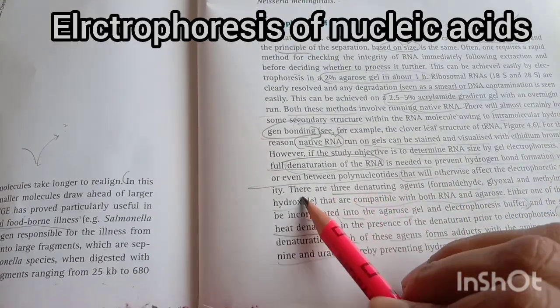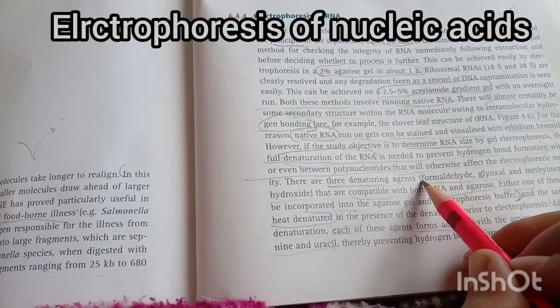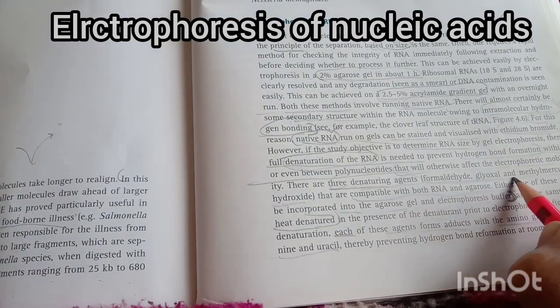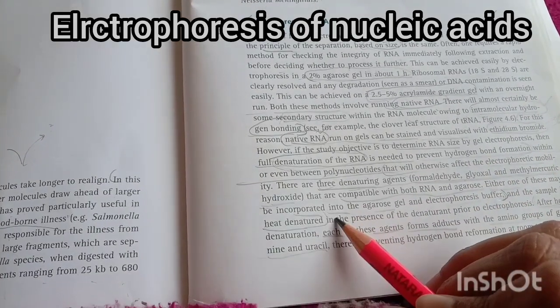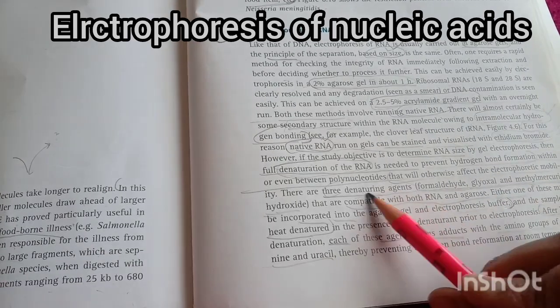There are three denaturation agents used for the denaturation of RNA, and this is the most important: I repeat, formaldehyde, glyoxal and methyl mercury hydroxide, which are compatible with both the RNA and agarose.